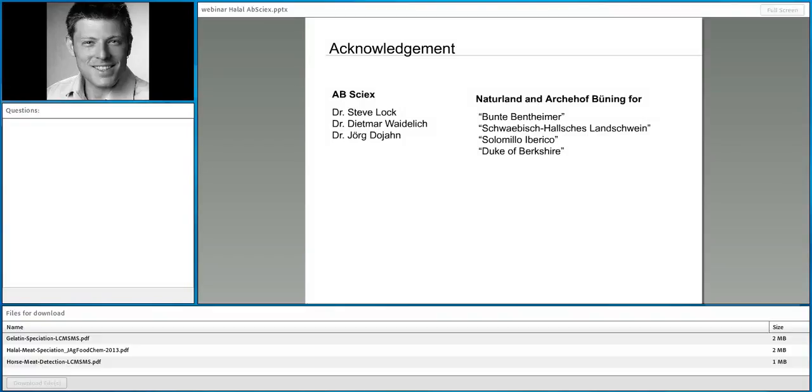Okay, good, thanks. Another question is, do you think this method would work with other types of food products, such as, say, for example, milk, so milk speciation and authenticity? Yes, so of course the approach in general will work. It's similar when it comes to, for instance, allergen detection. You can apply this form of identification of biomarker detection in principle for all kinds of food. And we do similar things for the detection of allergens, for instance. The first thing you, of course, have to do is to identify the biomarker peptides in your milk matrix. And if you have specific biomarker peptides, milk would absolutely work.